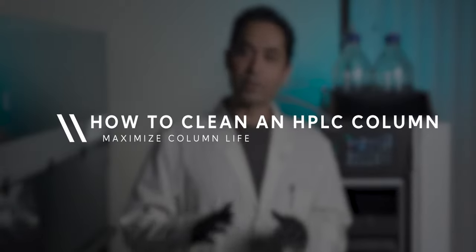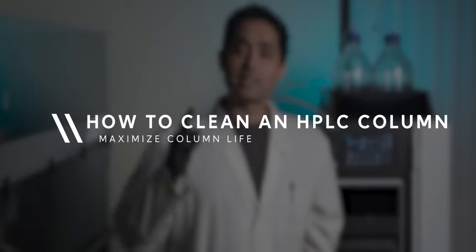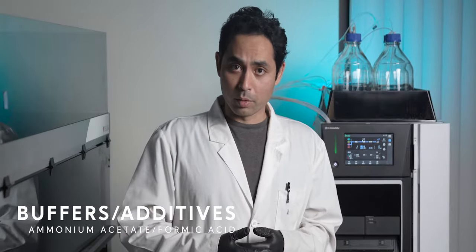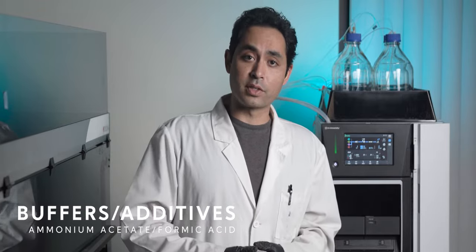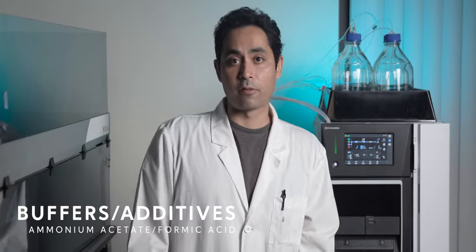In this video we're going to talk about how to flush an HPLC column in order to maximize column life. This is especially important to do if you add buffers or additives to your mobile phase, for instance, most people use something like ammonium acetate or formic acid.